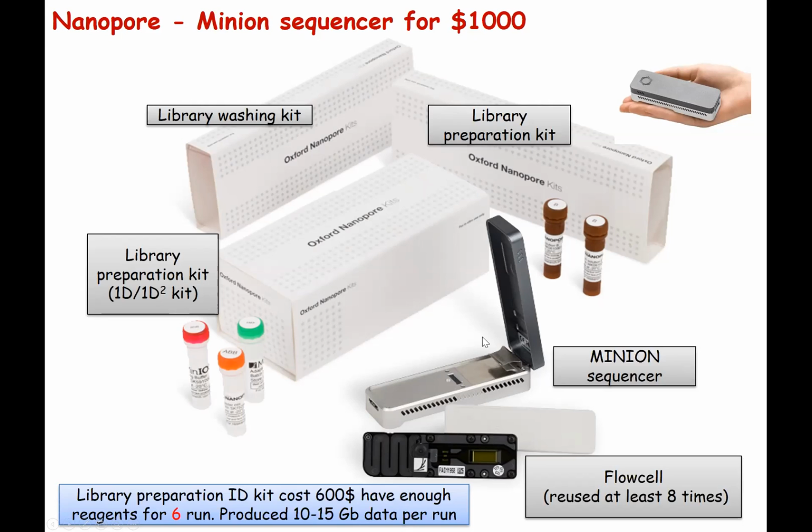The importance of nanopore sequencing is that they have kits and everything, and the steps are very convenient to do. It doesn't have to be very professional, only in terms of loading the library to the process. Most of the time, you get used to this technology very easily, and the preparation steps are not that huge compared to other short-read library preparations like Illumina ones.